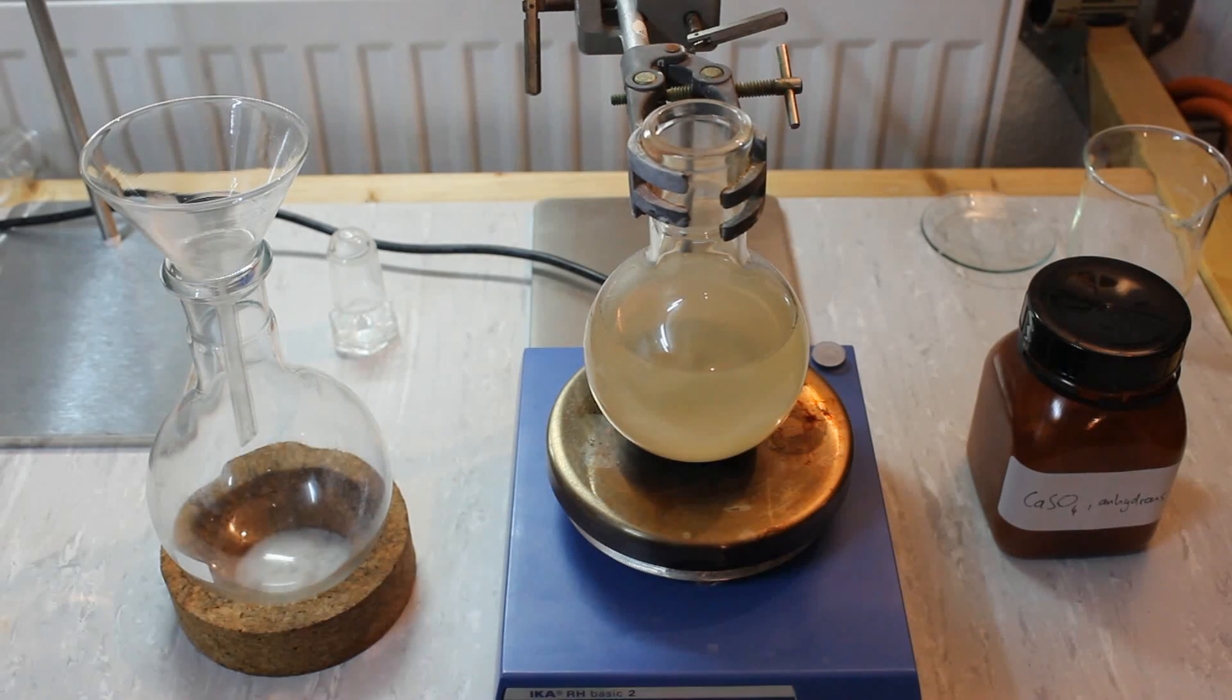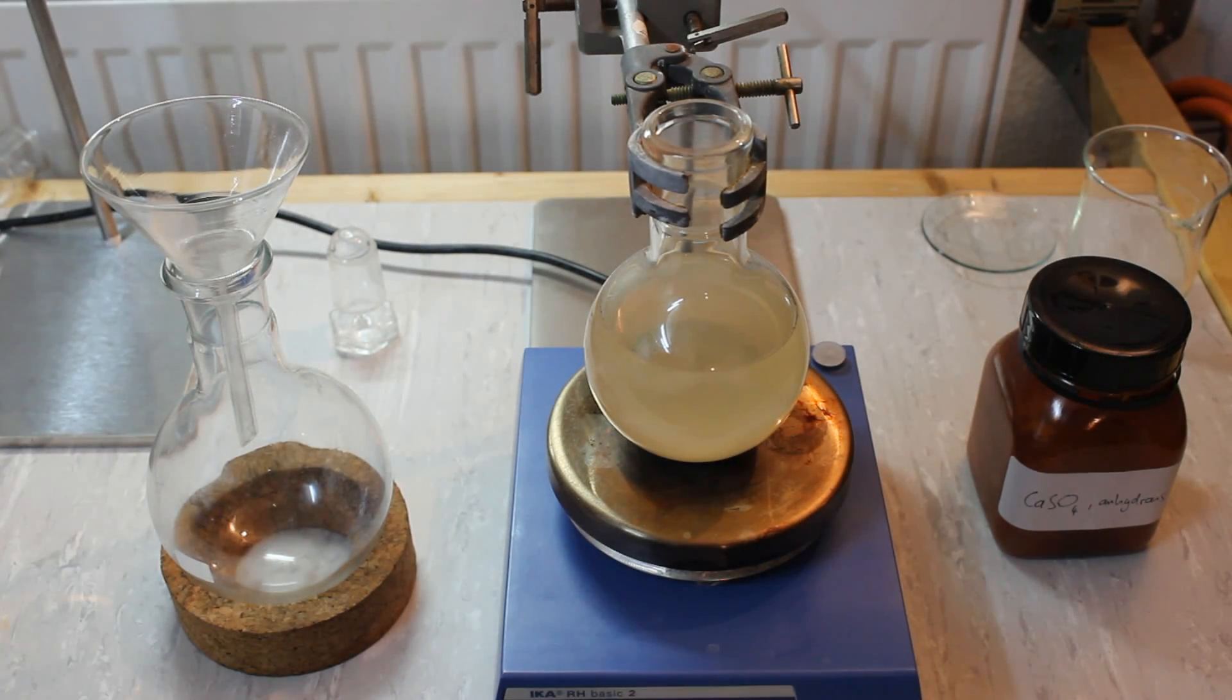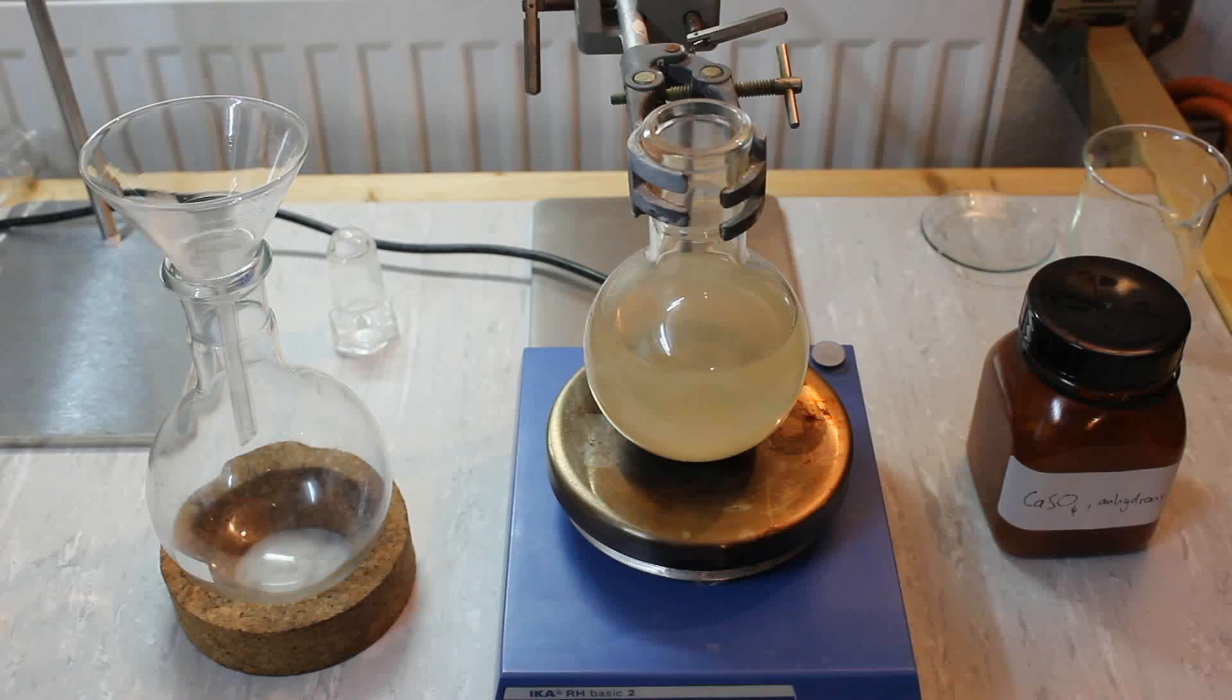I now transfer the acetone into a bigger flask so we can distill it. I'll try not to get too much of the calcium sulfate in there, but it doesn't really matter since we are going to add fresh calcium sulfate anyways.